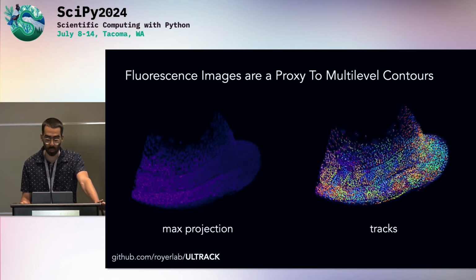And with this, we can obtain tracks for a 3D image, which very often requires a lot of effort because the off-the-shelf models don't have very fine-tuned weights. But here, just applying traditional image processing, we can obtain very accurate tracks.